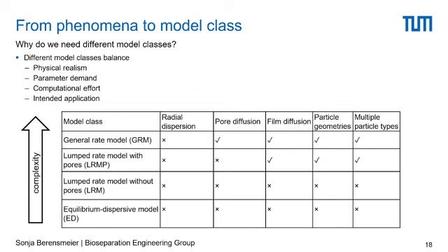For this transport model, there are now different approaches how to solve it, mostly depending on how complex we want the system to be, right? So depending on the physical realism, on the parameter demand, on the computational effort, and the intended application, we can apply different models.